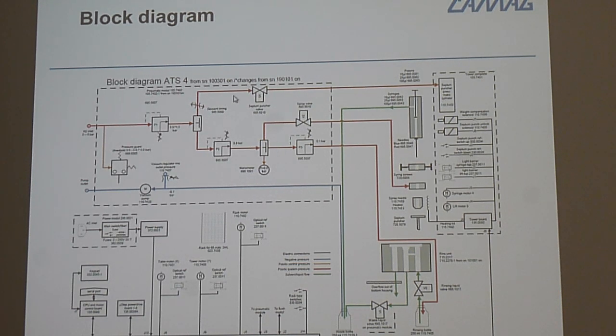That we have high pressure. High pressure means that we have a higher speed for the septum puncture and for the cylinder. And then the other goes to 0.8 bar. Then you see it on the manometer. And the other one goes to the spray valve. And one goes directly here to the rinsing bottle.